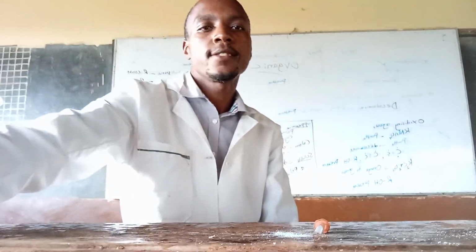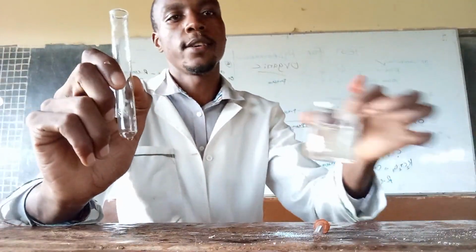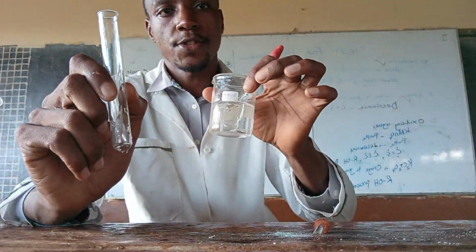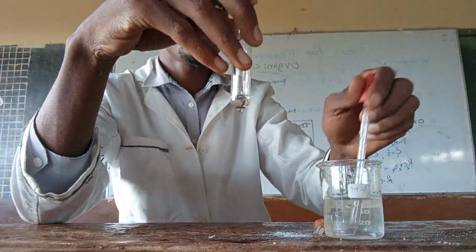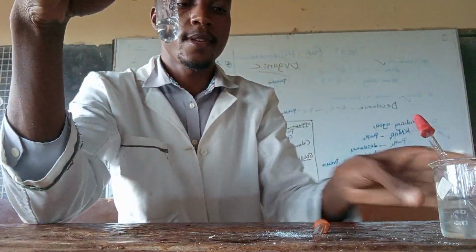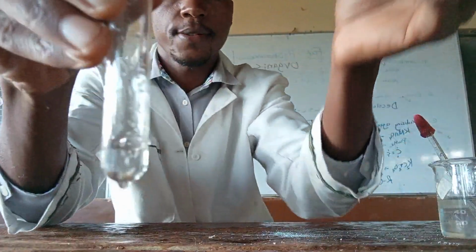And then another scenario whereby we go to our second solution. This is my second solution here. I add my portion here, and then 3 drops of sodium hydroxide.